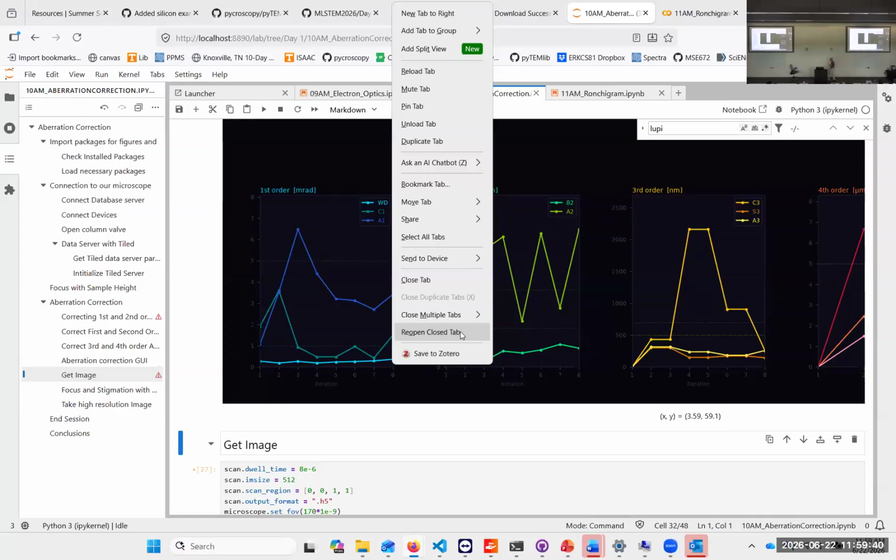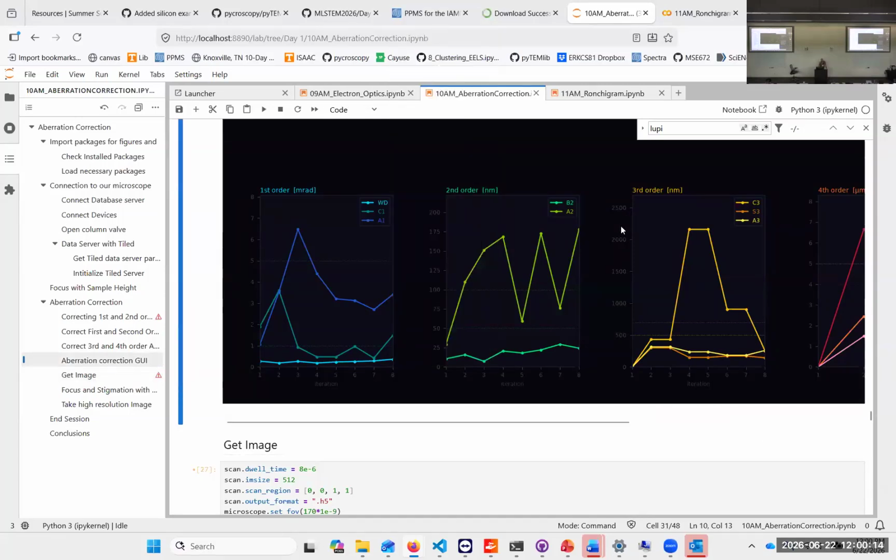We know how much it should change. And so we go actually backwards and forwards between simulation and the real image, and also to quantify the aberration coefficient. It's the easiest way. You can do it more complicated, but then I would refer you to Semlin's paper and have fun with that. But it's very, very straightforward to do it just with the calculations of that.